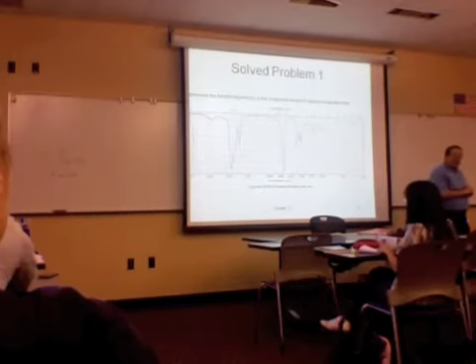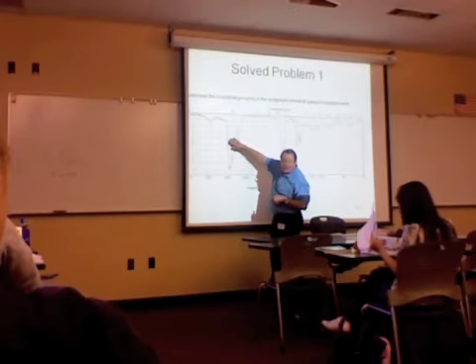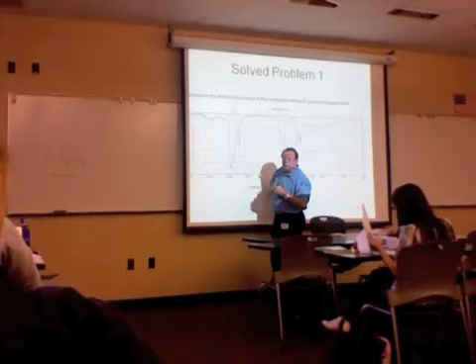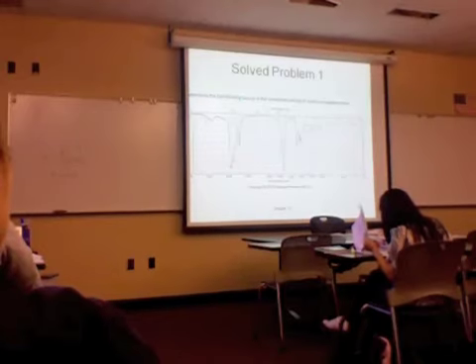Suggests an aldehyde. And notice that all of the main hydrogen stretches are below 3,000, so what does that tell us? Okay. Yeah, no carbon-carbon double bonds. I've got a saturated aldehyde, as it were. Does that make sense? That's pretty much all you can get out of the IR.